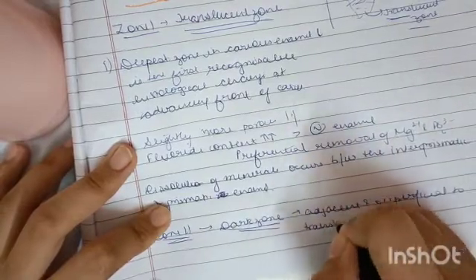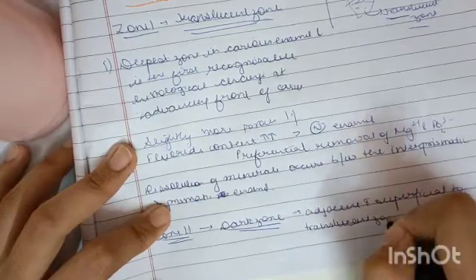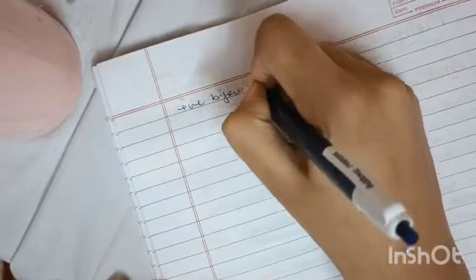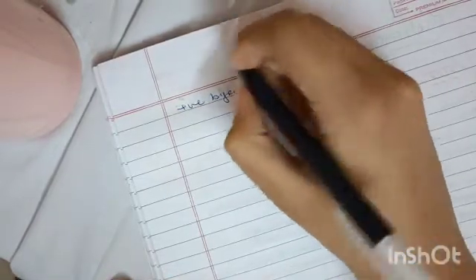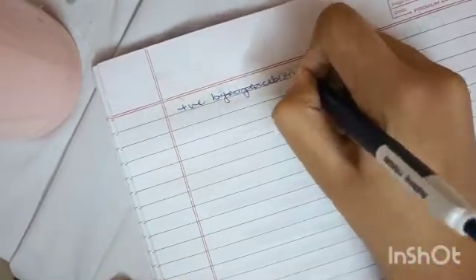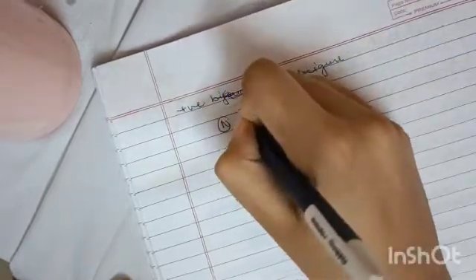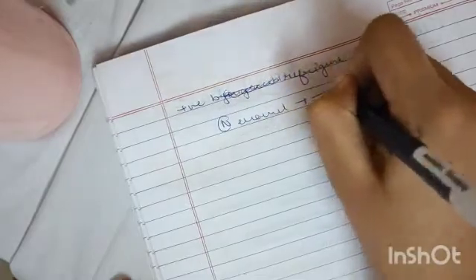A very characteristic keyword that you must remember is that it shows positive birefringence. Birefringence. In normal enamel it is negative, but here in the dark zone it is positive. You must remember this.